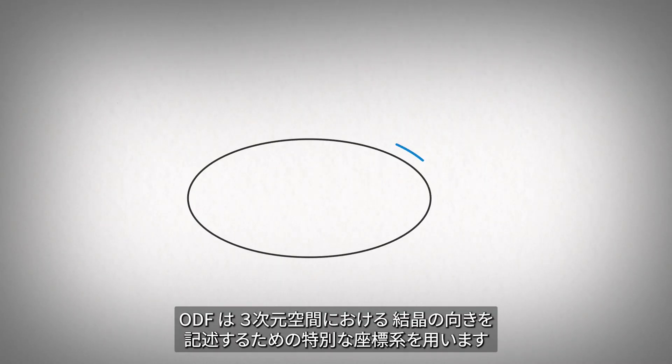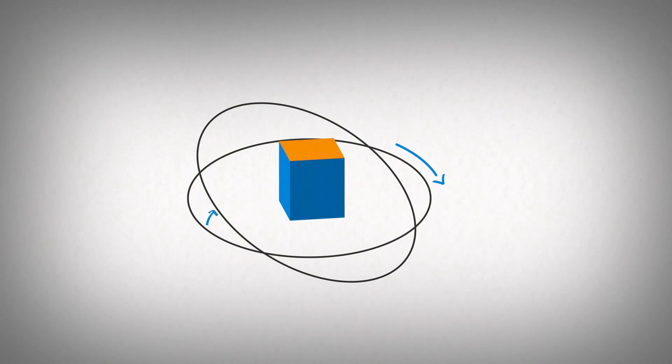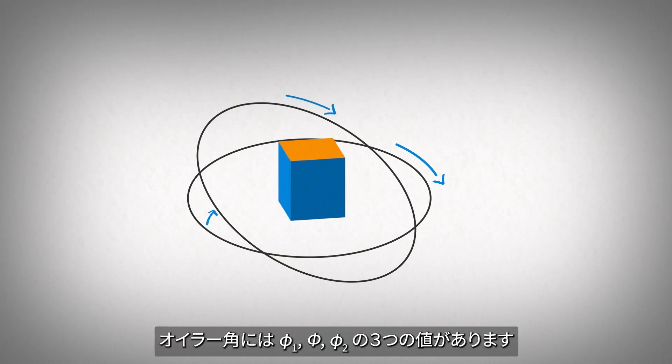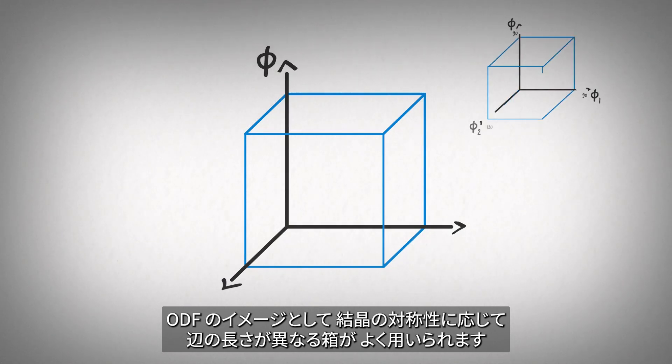The ODF uses a special coordinate system used to describe the orientation of crystallites in 3D space called Euler angles. Euler coordinates have three values: phi 1, phi, and phi 2.